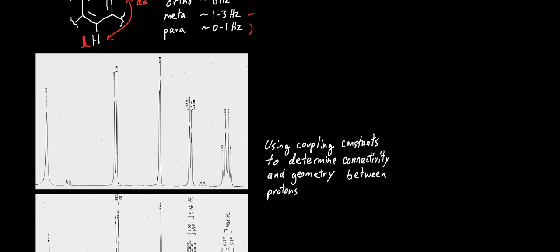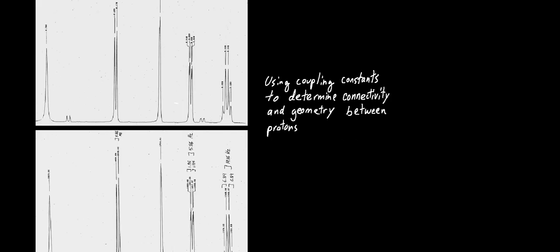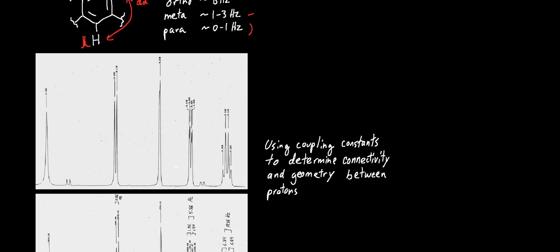Just to get a better visual idea of what this looks like, the top spectrum is in ppm. And so think about it. In your simple examples, you would have a pair of doublets, and you would know that those doublets are 2 protons coupled to each other. But what if you had a spectrum where there were like 6 different pairs of doublets? How do you know which pair of doublets is coupled to which?